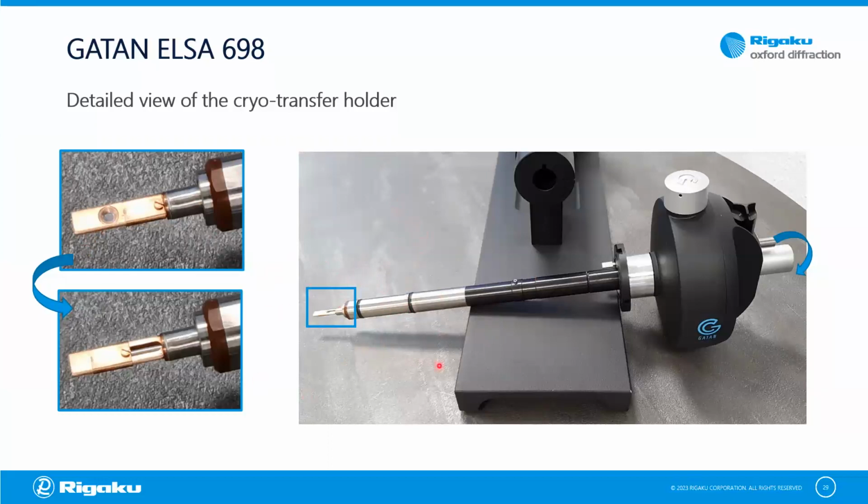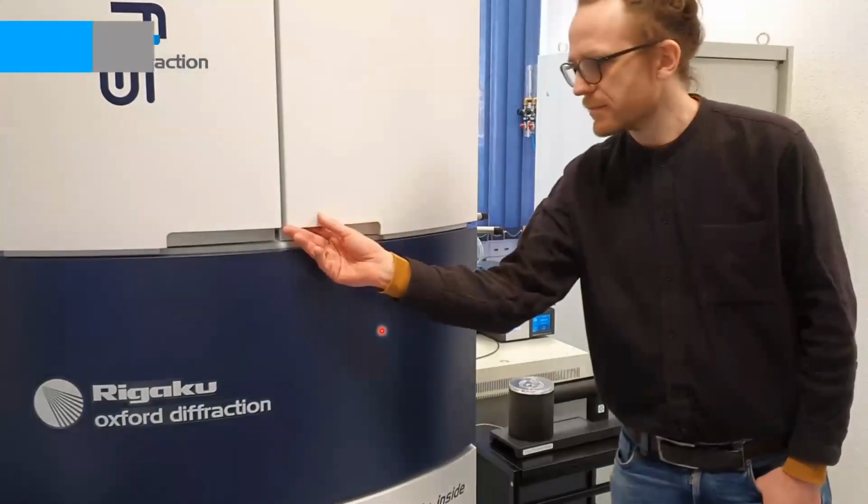And if you just walk with this thing through the lab with humid air and it's cold, of course, it will form some frost. And if frost forms on the sample, it will kill it, and the electrons just can't go through anymore. With the shutter, it is protected for long enough to put the sample from your transfer system into the diffractometer. And how this looks, we'll see again in a short video.